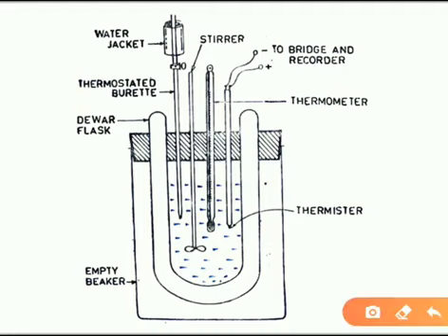The temperature measuring thermistor unit should be capable of measuring a temperature change of 0.01 degree Celsius.